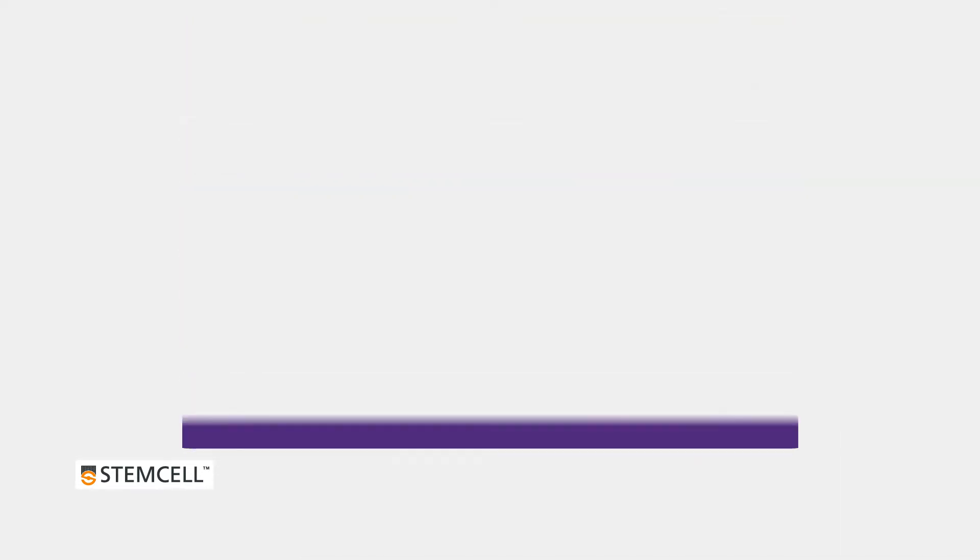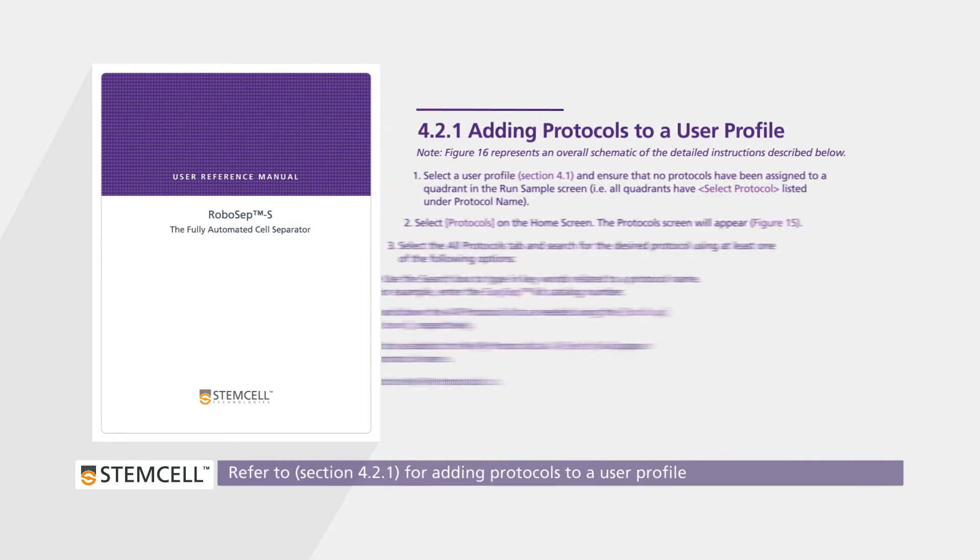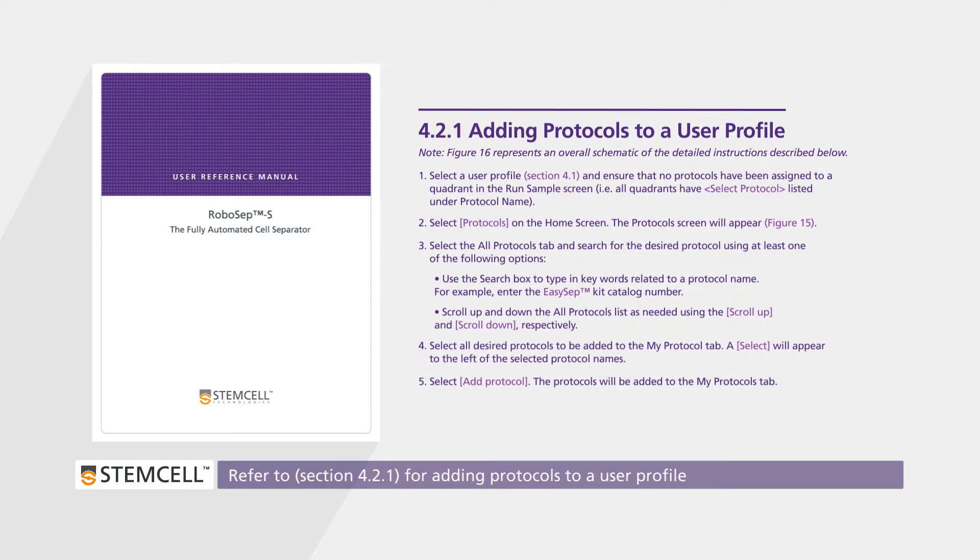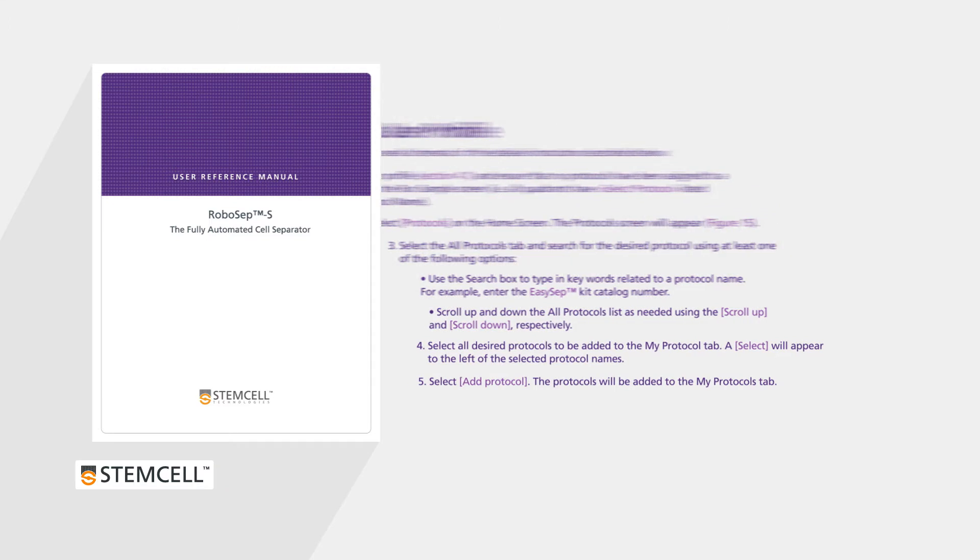If there are no protocols visible, or if you want to add more protocols to your user profile, refer to section 4.2.1 in the technical manual.